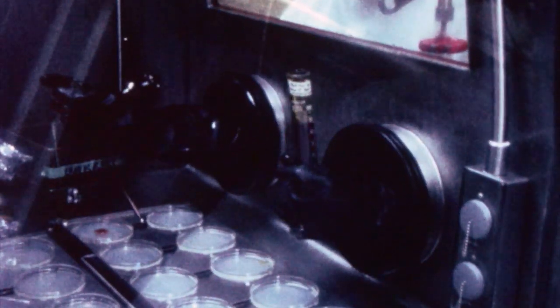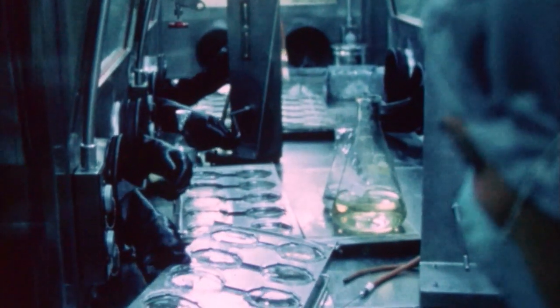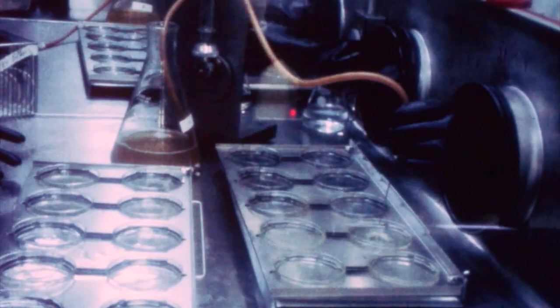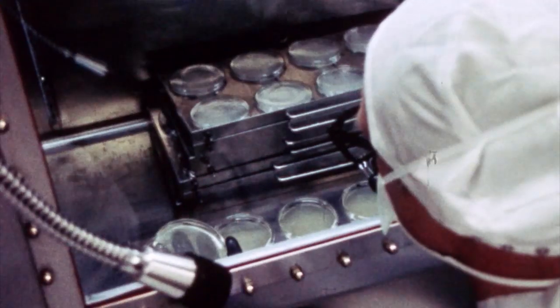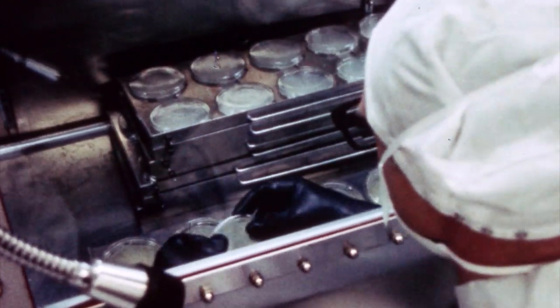We were culturing the samples under 300 different environments, and there were 10 Petri dishes for each environment. Typically, the way you make Petri dishes is you have agar with different kinds of chemicals in it, depending upon what it is you're trying to culture. In one of the sequences, you can see the guy sort of running like a little pump, going from Petri dish to Petri dish.